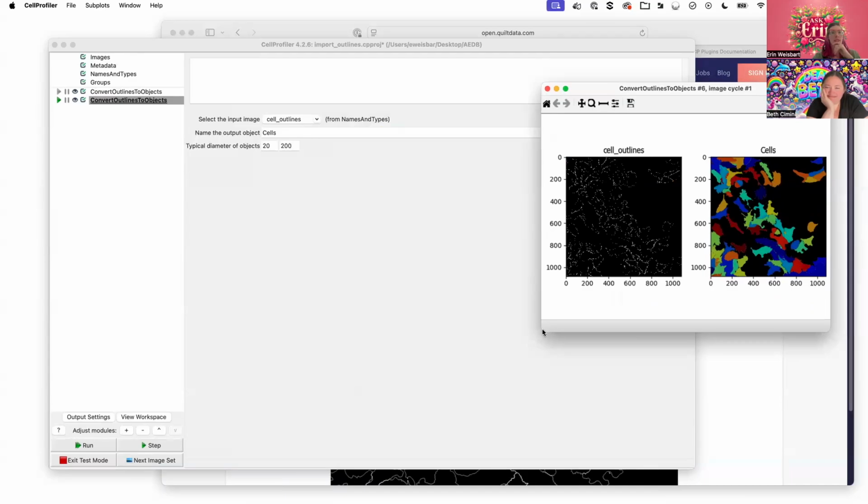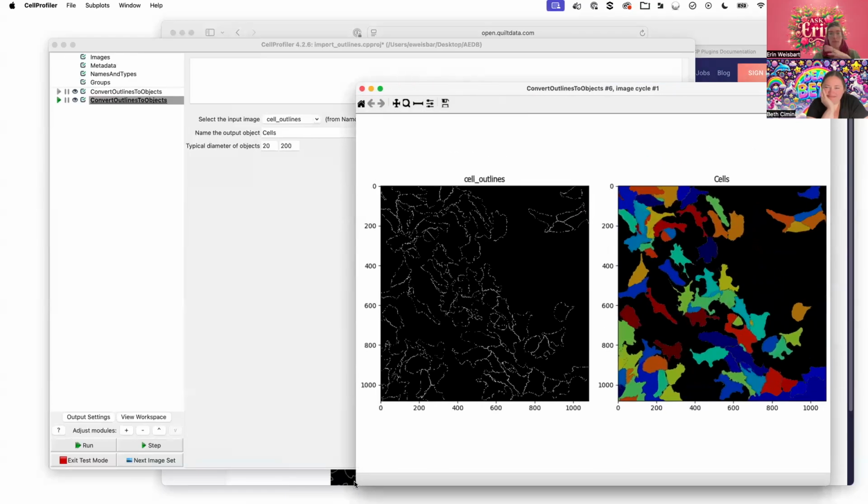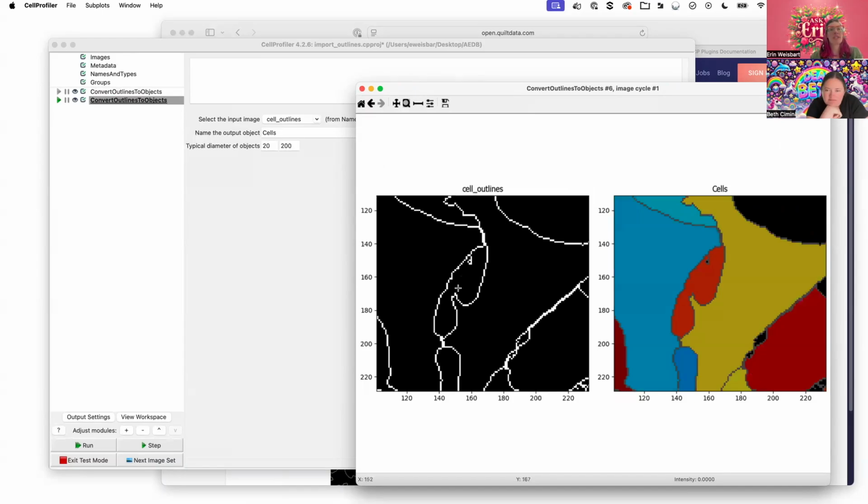I unfortunately default too much to automatically cleaning up after myself, and I clean up more than I should. So if we look at this, I can still see at a glance regions where I doubt that's a cell. I bet that is blank space that is not supposed to be there.